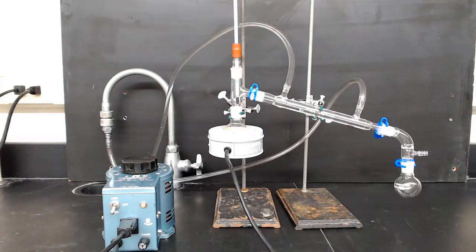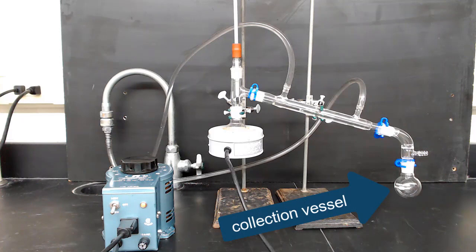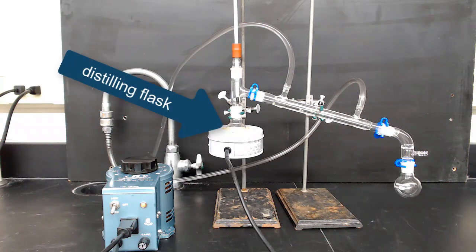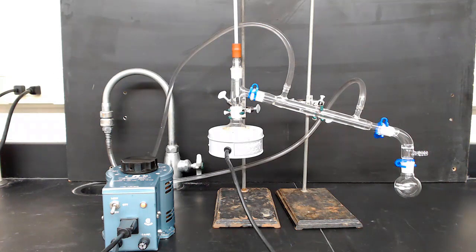You can change the collection vessel as frequently as needed to collect different fractions. In a typical distillation, you'll have one or more liquid fractions that you collect, and then there'll also be a residue left in the distilling flask. In today's experiment, tert-butyl chloride is fairly pure and will only collect one fraction.